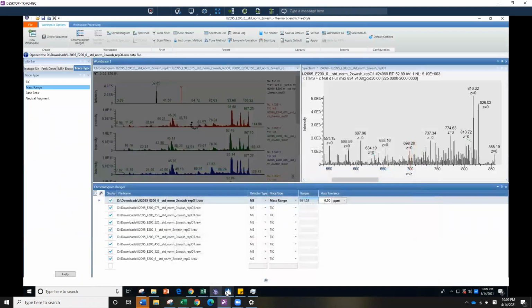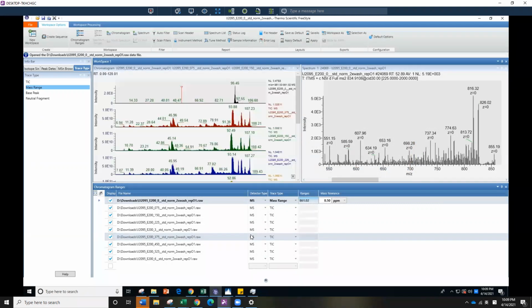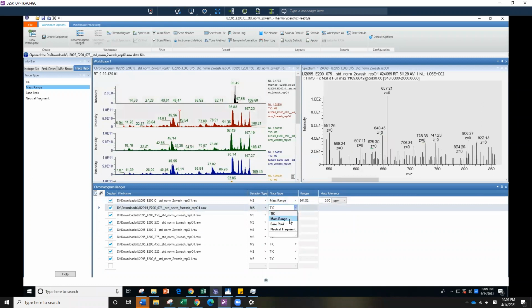Interesting. So now it is waiting. We want to see something that is at 95 minutes. So great, the major peak is right here, which is a huge peak. And then you're going to change all of it to that kind of.